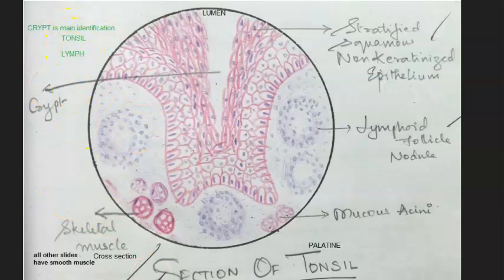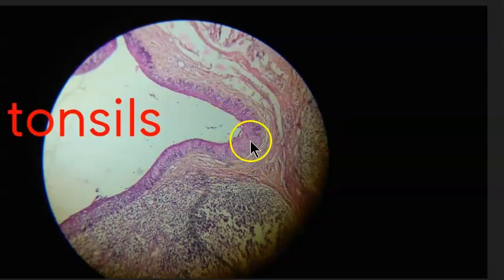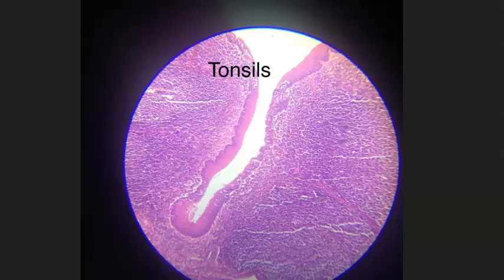Some notes has been made here. Do you see crypts in that one? Go there, please. Oh yeah, we do see crypts. Okay. Oh wow, such a beautiful crypt. Now it makes sense. If they give like this, then we will easily recognize, right?